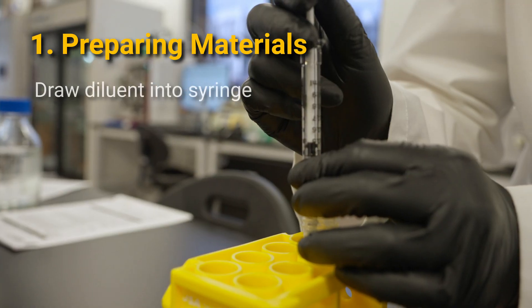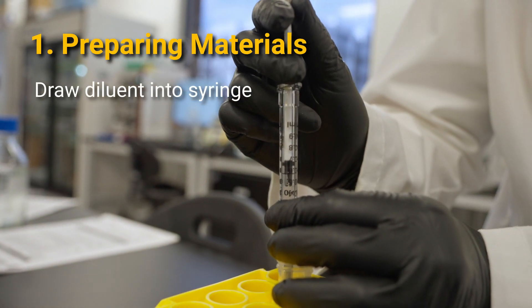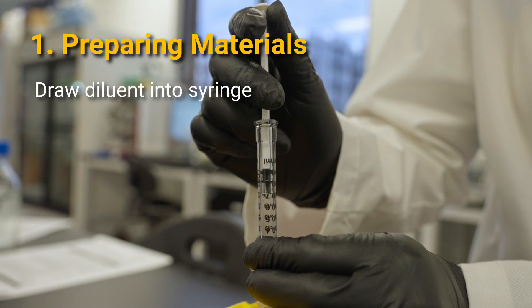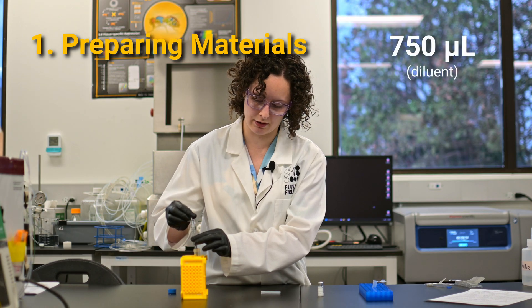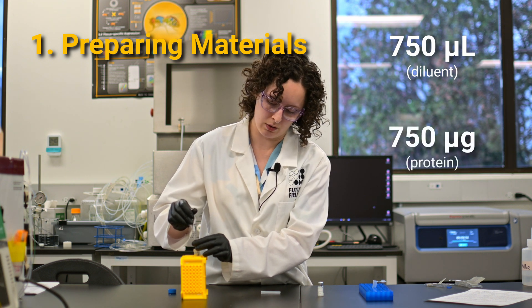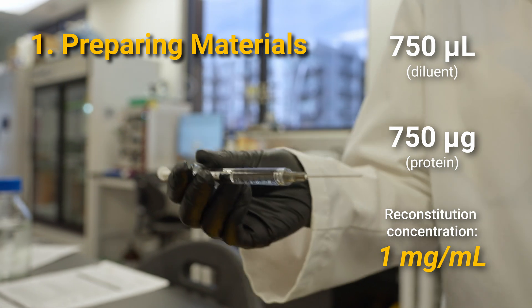Next, we're going to draw up the volume of diluent we need using our syringe, depending on the size of your vial. I need 750 microliters because I have a 750 microgram vial and I want to make a 1 mg per ml solution.